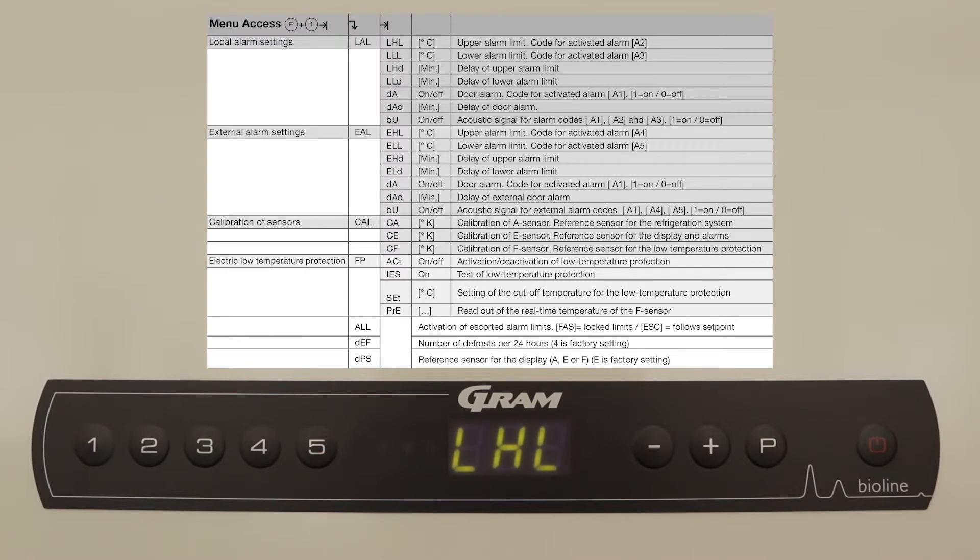You are now presented with the following list of local alarm settings: the upper alarm limit, lower alarm limit, delay of upper alarm limit, delay of lower alarm limit, door alarm, delay of door alarm, and acoustic signal. We will begin with the upper alarm limit.